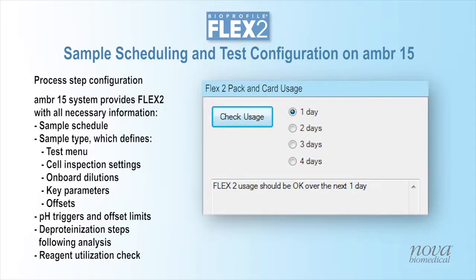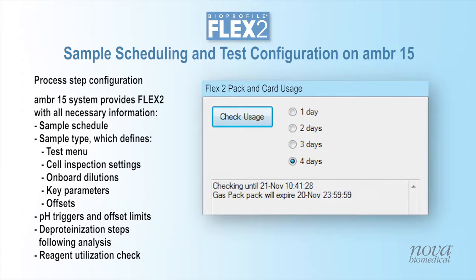AMBER software allows users to check for sufficient Flex2 reagents to ensure all scheduled testing can be completed for up to 4 days of scheduled samples. If reagents will be depleted or expired within the desired period, AMBER software will provide a warning, reminding users that replacement of reagents will be necessary in order to complete all scheduled analysis steps.